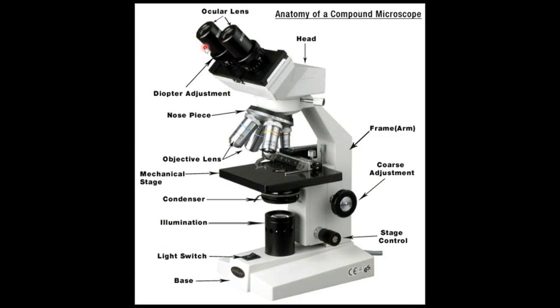So, ocular lens. What do we want to do with this information I'm giving you on the exam? There's going to be a diagram of a picture like this and a pointer saying, name this microscope part. If it's pointing at the here, you would call it the ocular lenses. See, look at that. Lens is singular. Lenses is plural. Oh, this is a little bit wrong here because it says lens, which means singular, but it's got two arrows. All right.